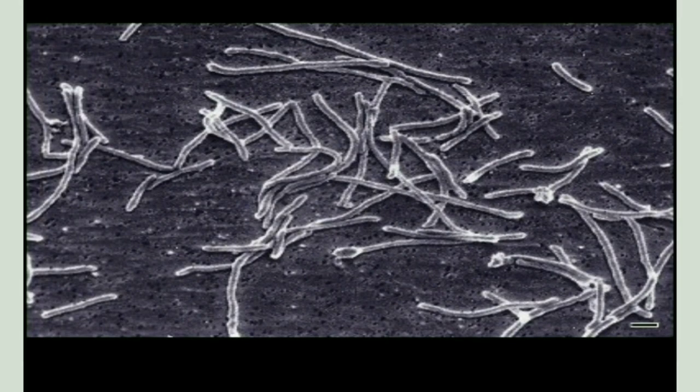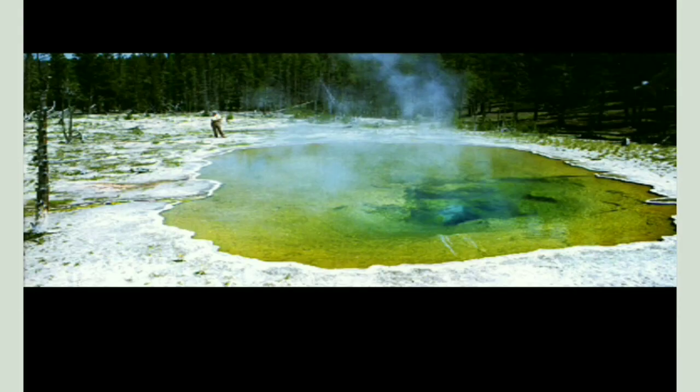This diagram shows the Thermus aquaticus, that is the bacteria from which Taq polymerase has been isolated. This diagram shows that Thermus aquaticus lives in hot springs. These Thermus aquaticus are able to withstand a high temperature since they live in high temperature.